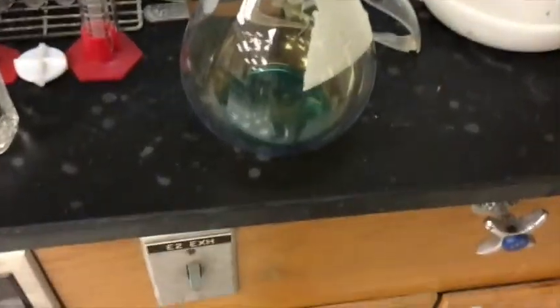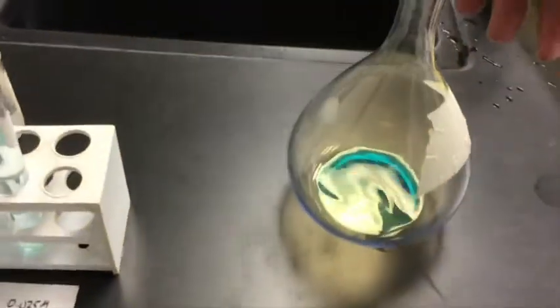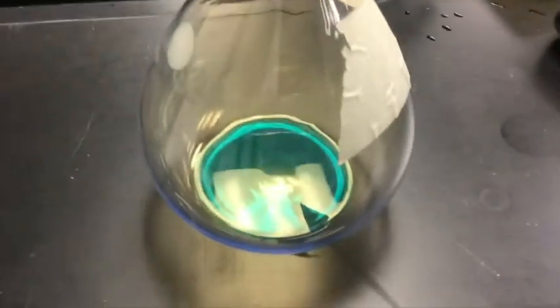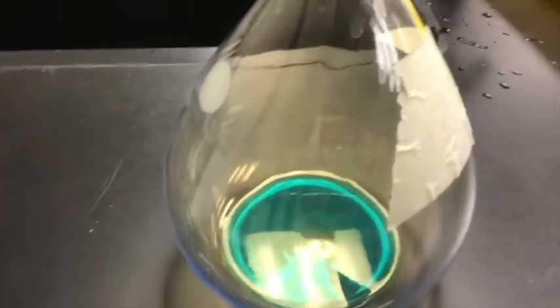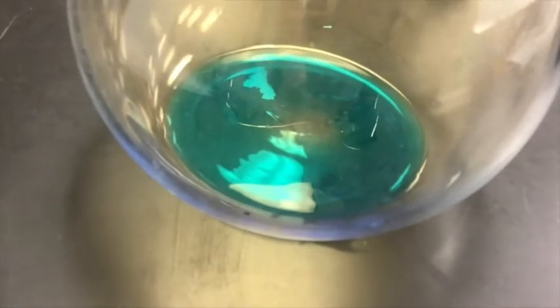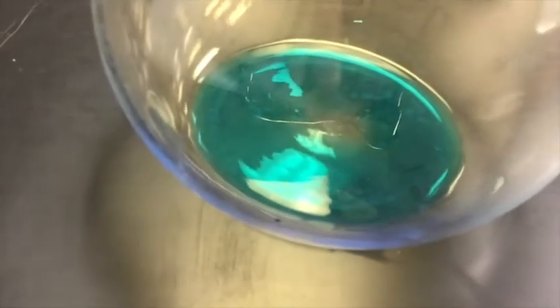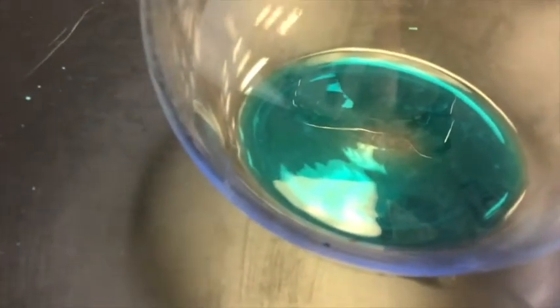So here is our volumetric flask after having spent all night reacting and having time to get all the brown gas out of there. Although, to be honest, from where I'm standing, there's still a tiny little bit of brown gas in there. And you can tell that the copper ions are there because we've got the blue color that is there.